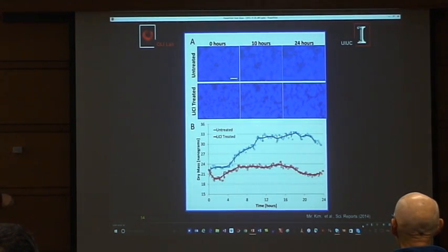So the first thing we measured from our images was the growth. We took the total dry mass produced by that dish. And here's what we found. There was a couple of hours here where the cells were kind of getting, I don't know, comfortable. And then there was a steep growth for about 12 hours or so. And then nothing. They flattened the growth. This matches what we witnessed in the movie: they need to grow only enough to hold hands, and then they don't need to grow anymore. And this is much smaller growth for the treated cells.